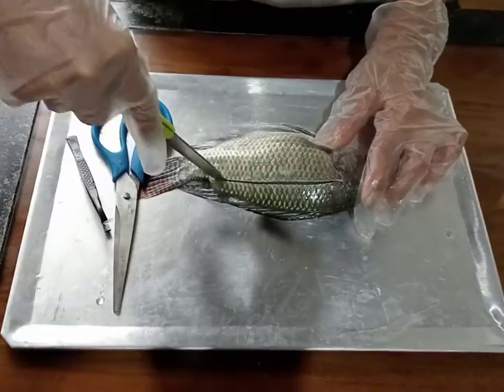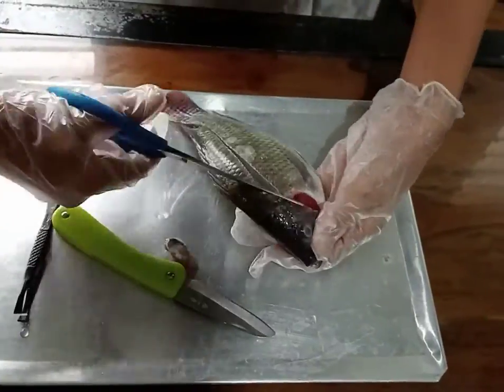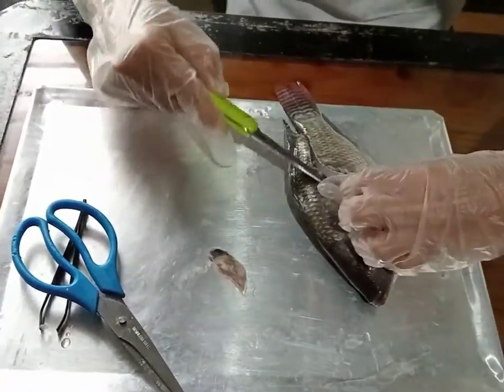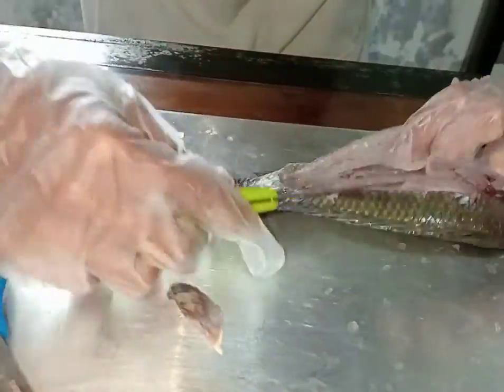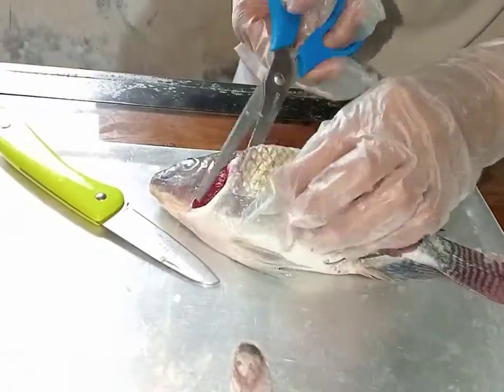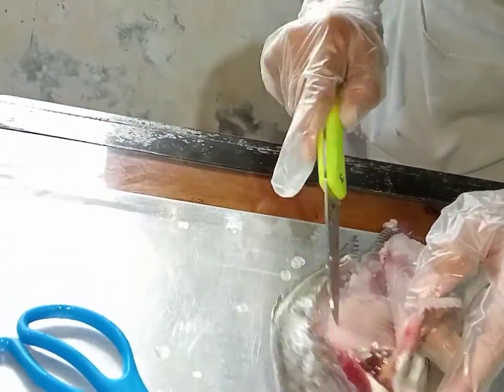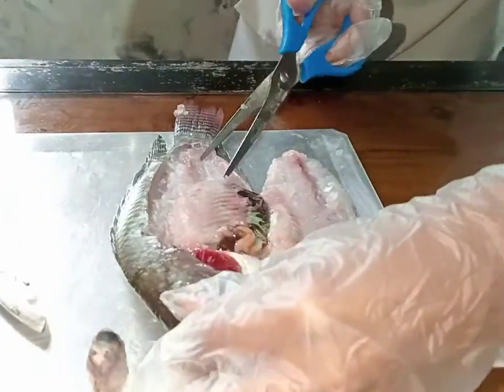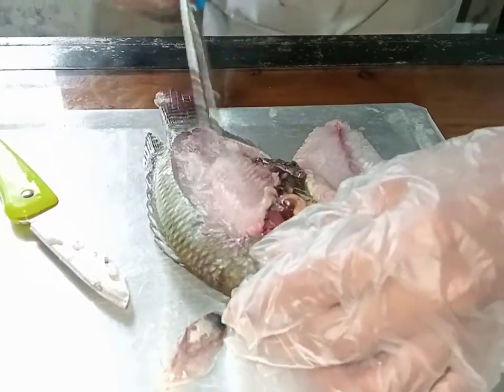And now, I am going to open the internal body of the tilapia. In opening the tilapia, you must be careful in handling the tools you are using. I am going to explore the internal parts of the tilapia.